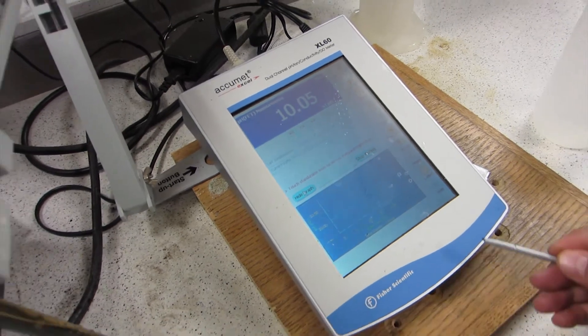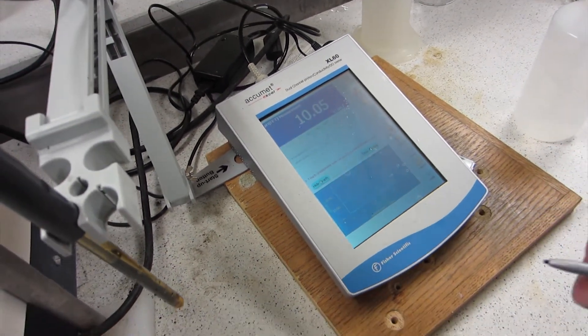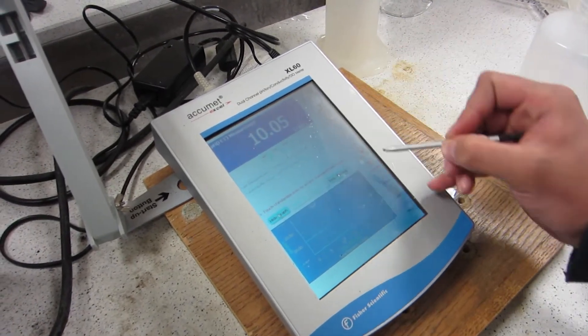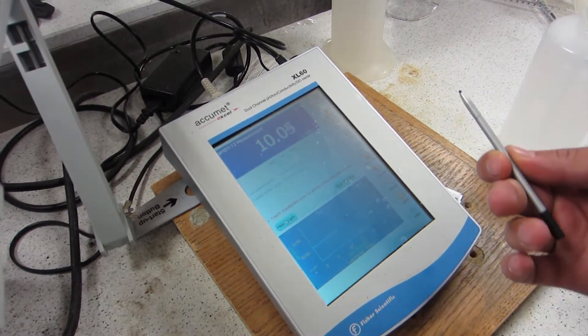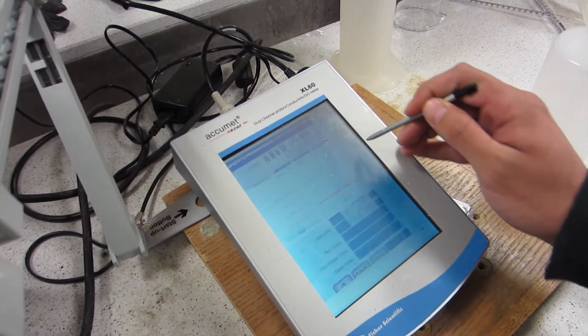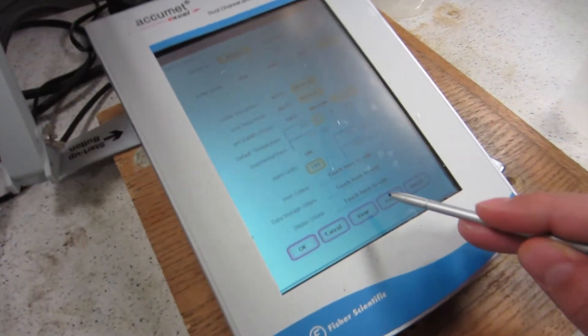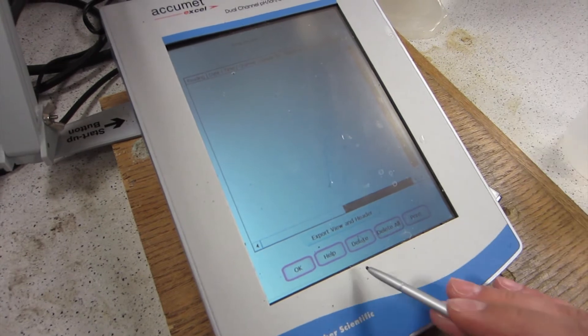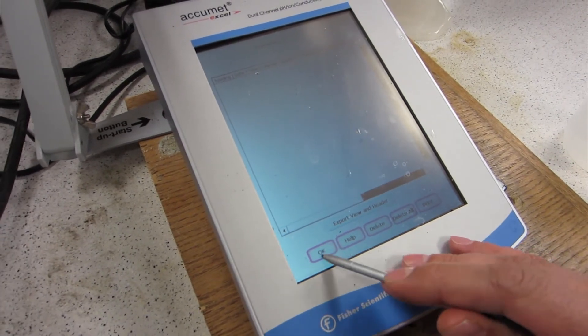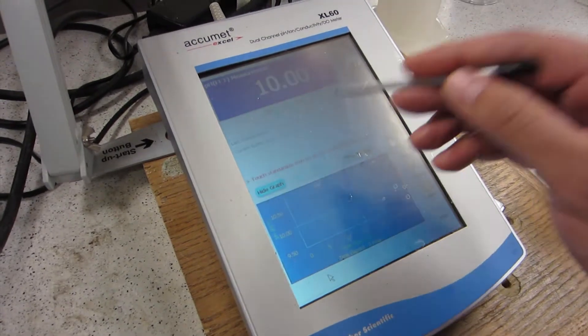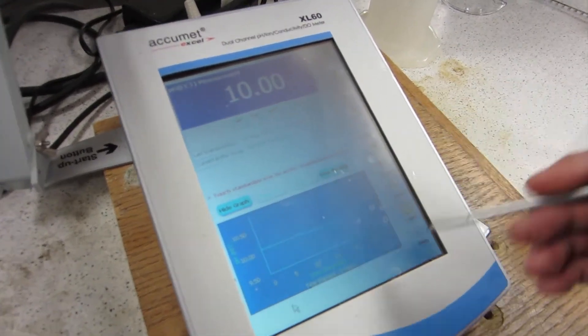Okay, so how do you get data off of it? Okay, real quick. Before you go into there, you have to make sure that when you clear the previous file from whatever day before you did, you're going to go to your setup, you're going to go to view, and then you're going to clear all this. The point of that is so that you have new data from today's experiment. When you delete it all and get out of here, as soon as you get back to this screen, it's taking data.